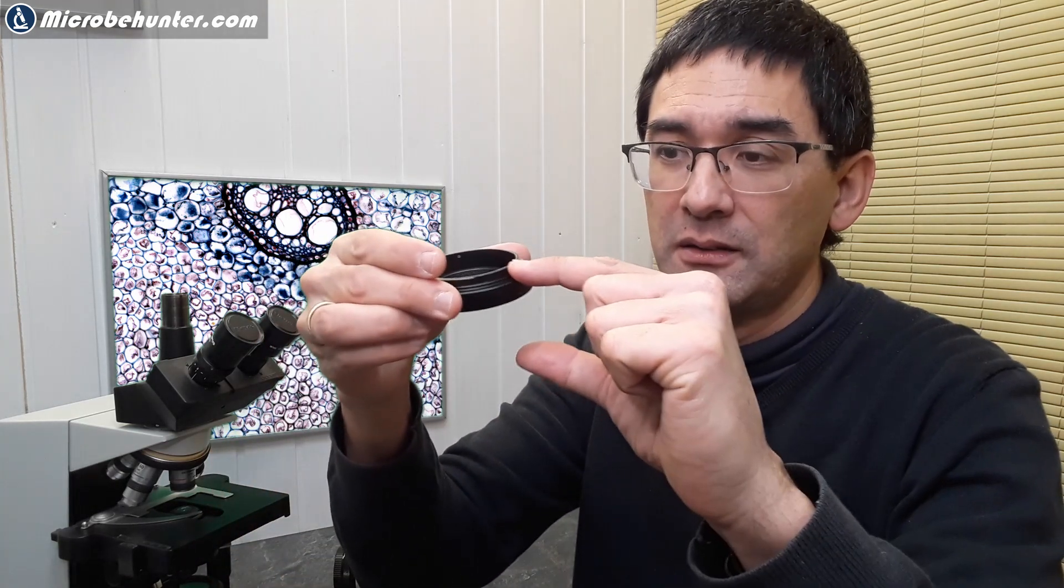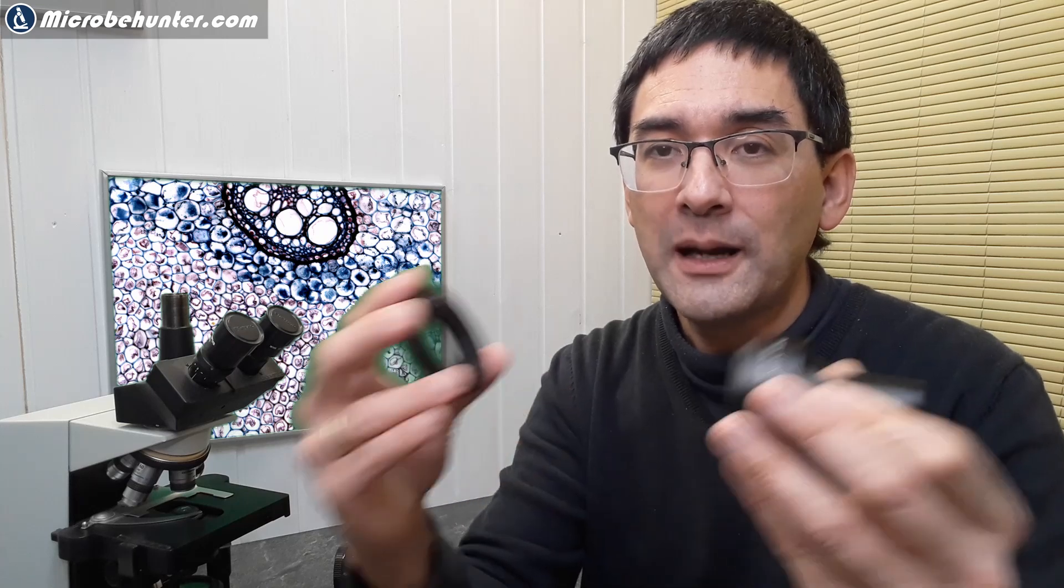However, there are now some modern mirrorless cameras where the T2 adapter ring does not look like this, but it's actually quite thick. Why is that? The reason is that modern mirrorless cameras, they have the sensor much more further forward in the camera and you need a thicker T2 adapter ring to again adjust the distance. What I want to say with that is, generally, you don't have to worry about the distance because if you use the correct components, they are designed in such a way that you already have the correct distance. In other words, the fact that the sensor is so much more forward in the camera is compensated by a thicker T2 adapter ring.